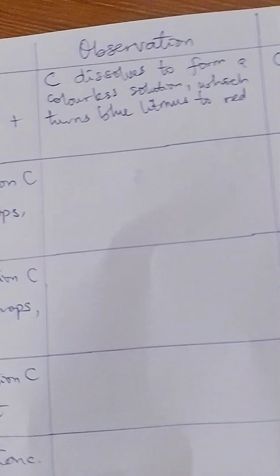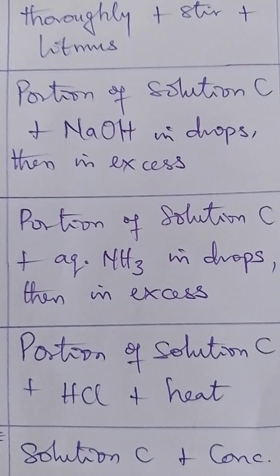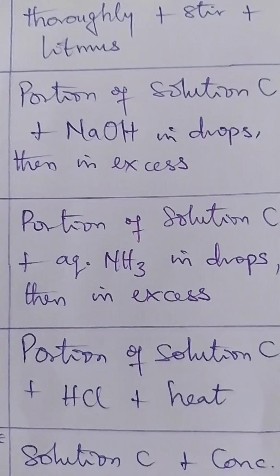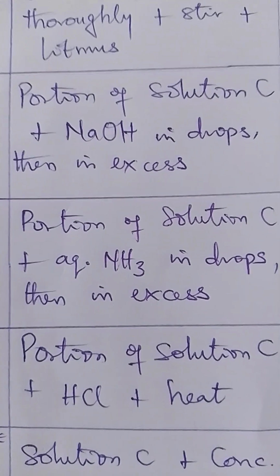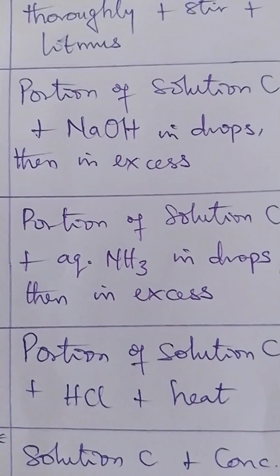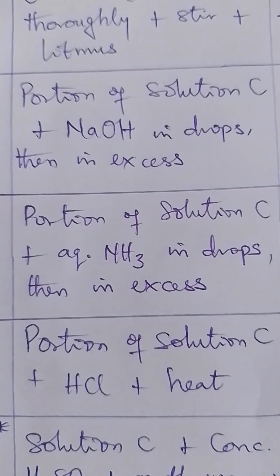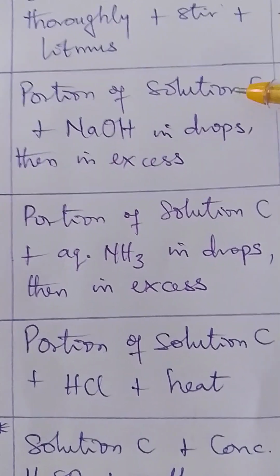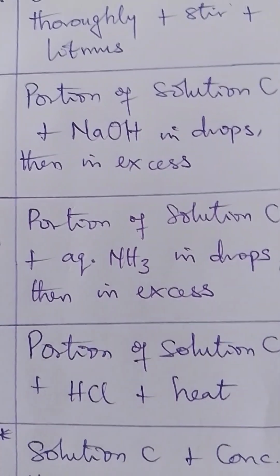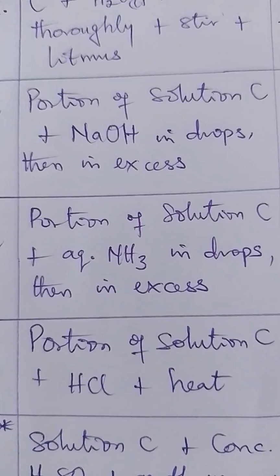Okay, not to waste time, let's go to the second one. I said portion of solution C. Of course, in the exam they can give you first portion, second portion, third portion. I do want to label first, second, or third so that you know, because some of you like to cram. I don't want any of you to have problems in the exam. So just know whatever portion it is of that solution C. We are saying solution C now because we have mixed it with water. So you either say solution C or C aqueous. It's still the same thing. All right, whatever you see, however it comes.